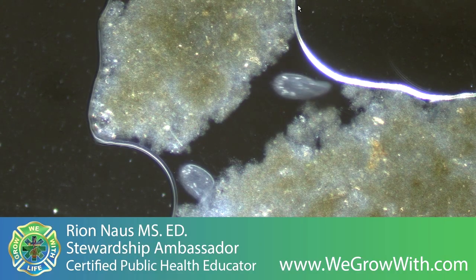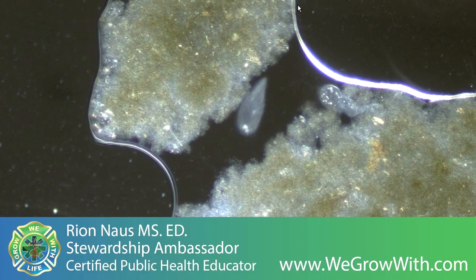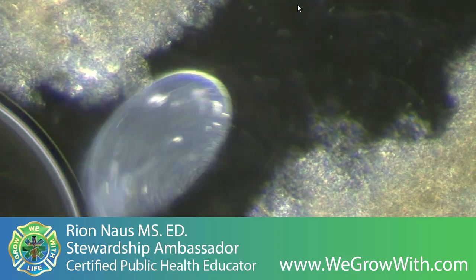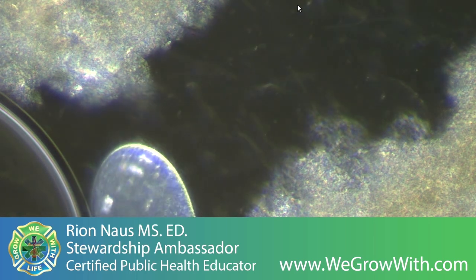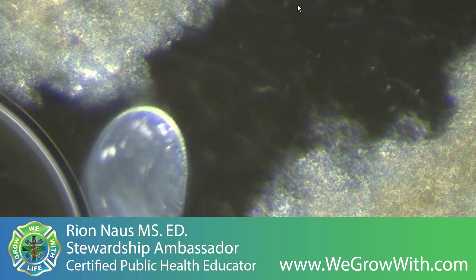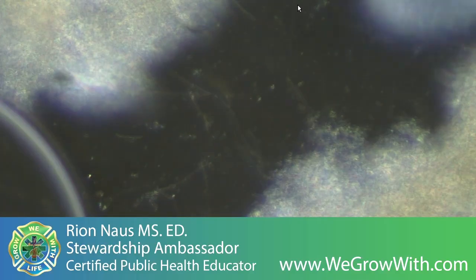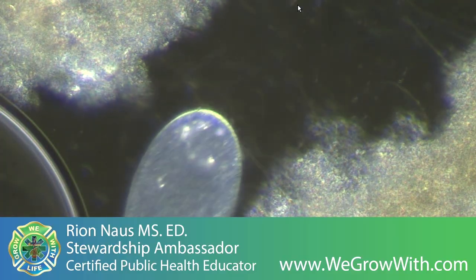The nice part is if it's natural, then this system still continues to help make microaggregates, which are required for it. It's interesting. You can also see the viscosity, the thickness of the fluid itself having changed.